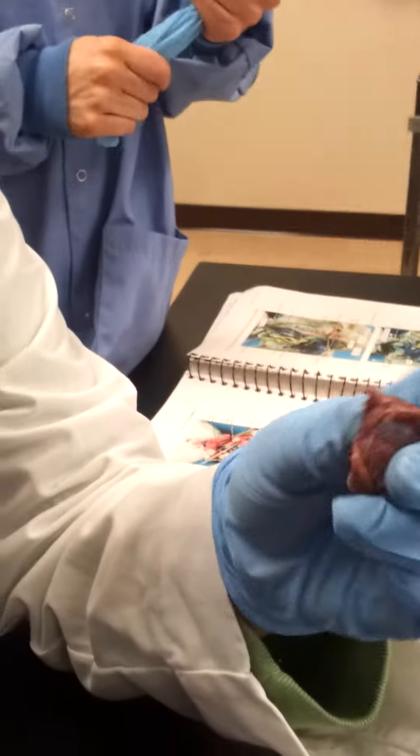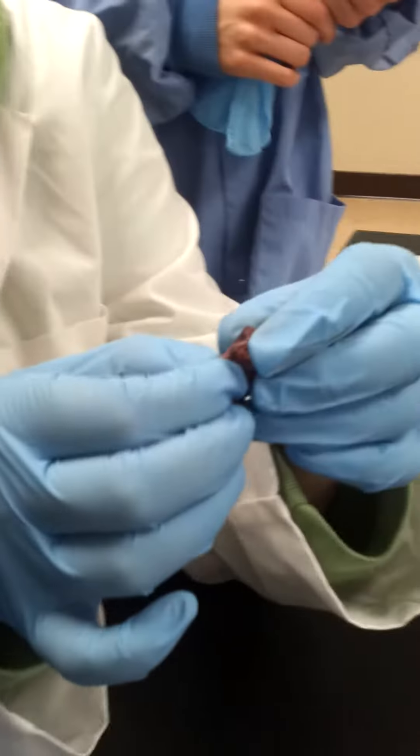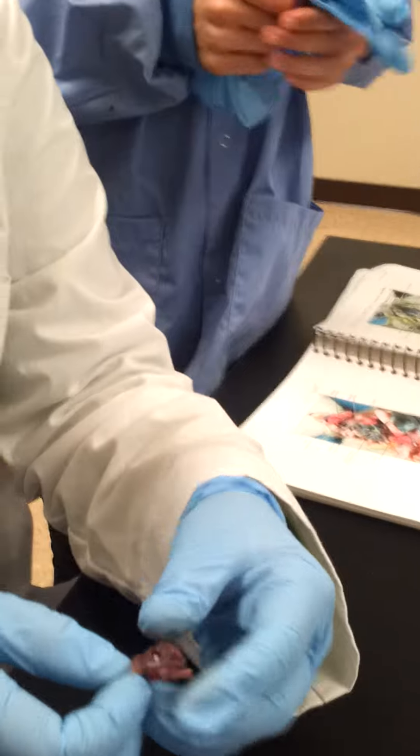Oh my God. Alright, I think we're good. I'm going to stop this video. Thank you. Can I have the scissors?